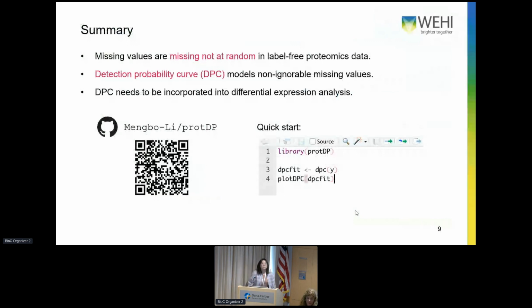One quick question. I think you said, if I caught this correctly, that imputing the values would lead to a loss of error control. Could you comment on that? Why is that? In theory, single imputation methods are problematic. Sure, but if you did multiple imputation, right? That is an option, yes. But in practice, it will be kind of tricky to implement, and we will also have to take into account the cost of computation. Okay.